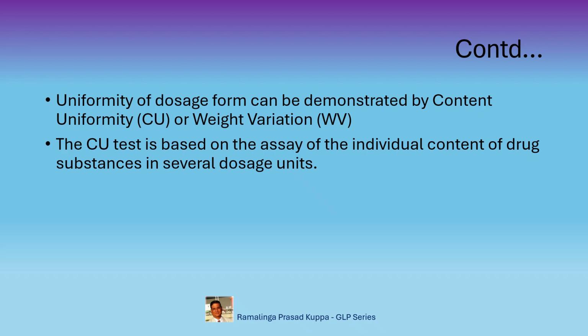The CU test and the calculations involve the assay of each individual API in the dosage form. CU may be applied in all cases.